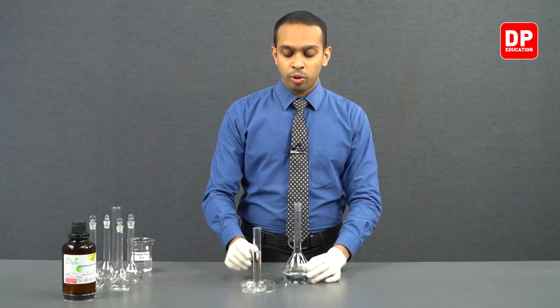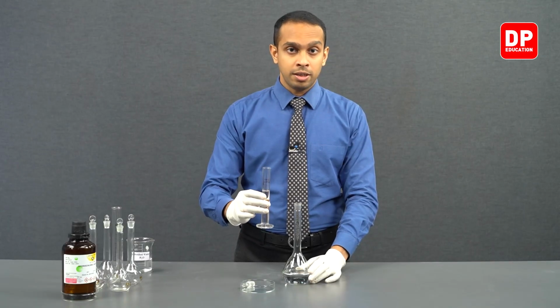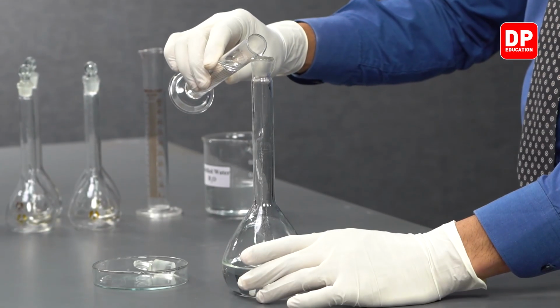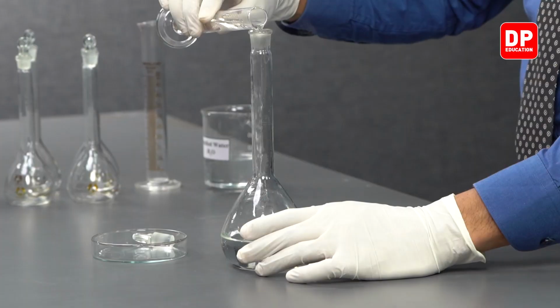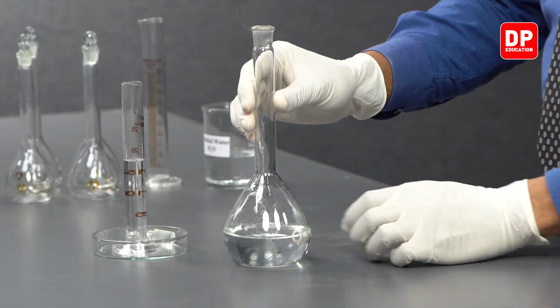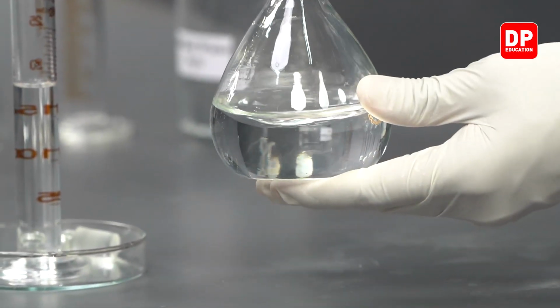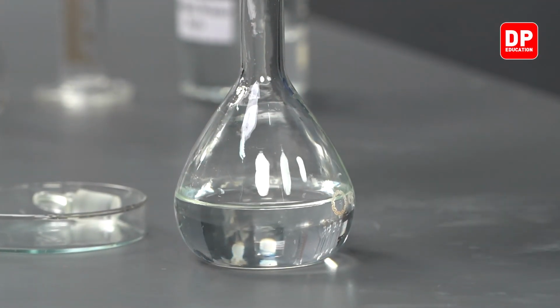And then we are going to slowly add our HCl little by little, gradually, into this volumetric flask that already contains a small amount of water. After adding a little bit of HCl, you can proceed to swirl it around and dissolve the HCl. And then we can proceed to add a bit more HCl.